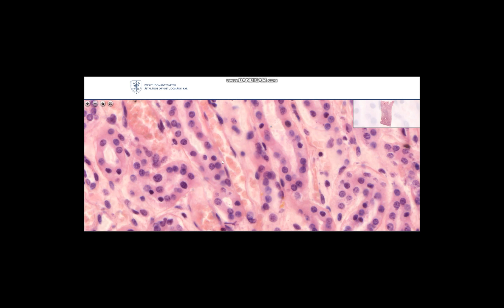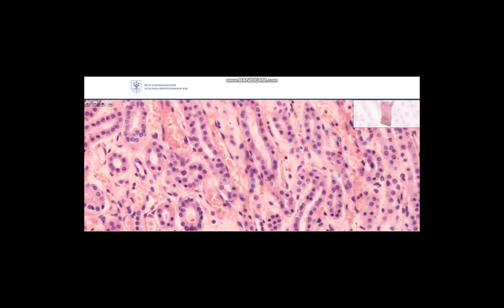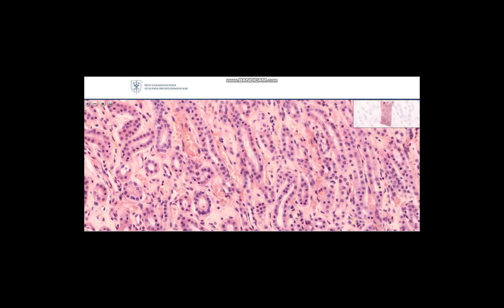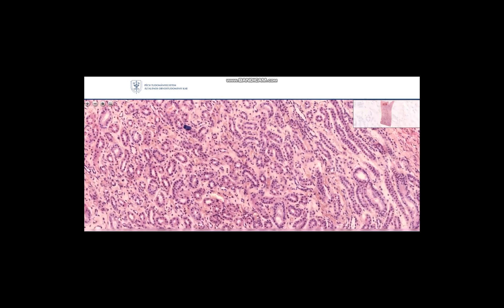We have another type of simple squamous epithelium here — we call these endothelial cells. Endothelial cells line the blood vessels and also the lymph vessels, so all vessels are on the inside lined by endothelial cells. These cells are very, very thin; actually you only see the nuclei — just a line, a contour.